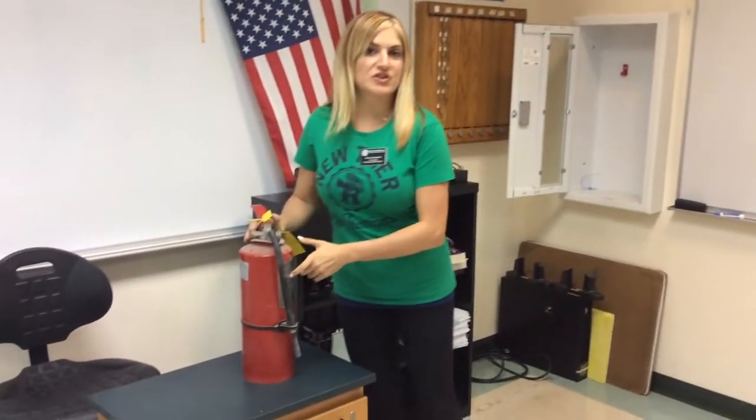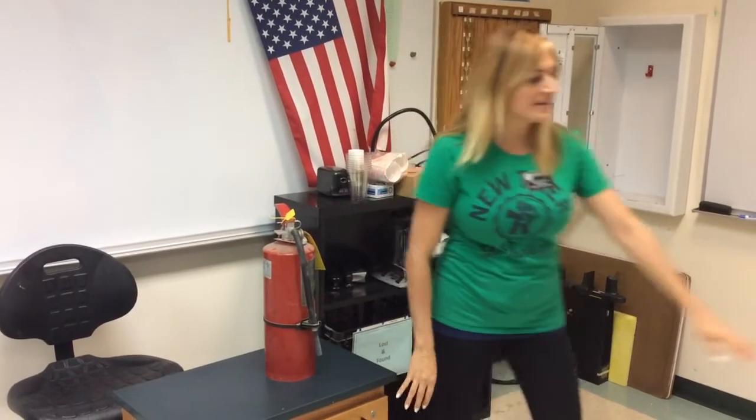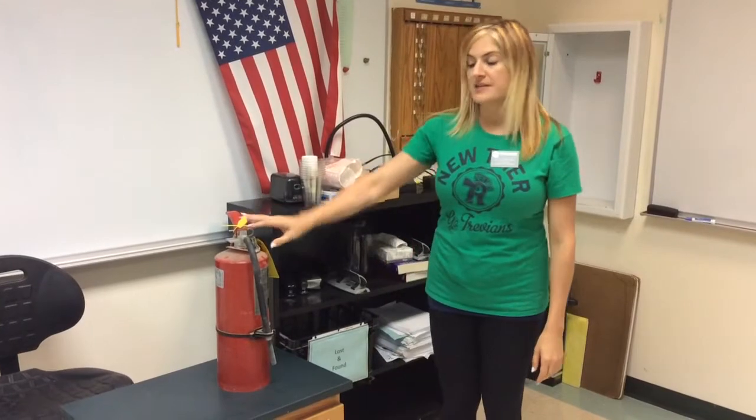The fire extinguisher is used to put out big fires. For example, if your lab table is on fire, you can put that out. Anything that's wooden and even plastic can be put out with the fire extinguisher.